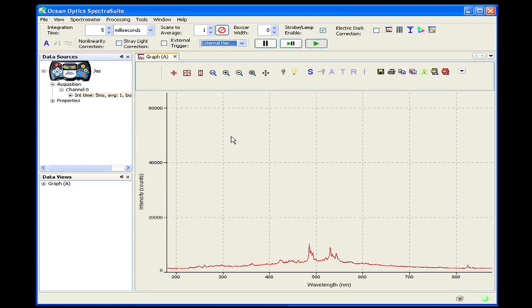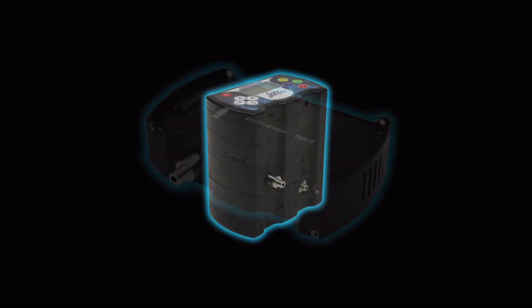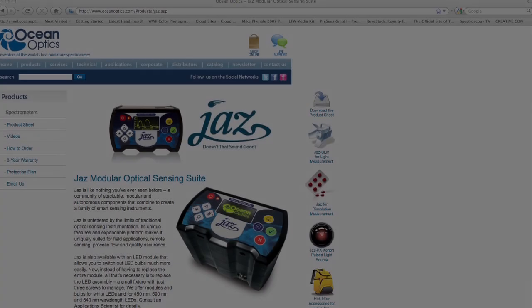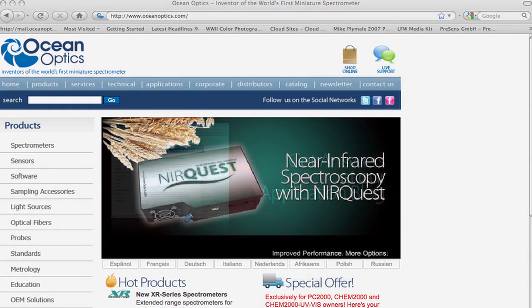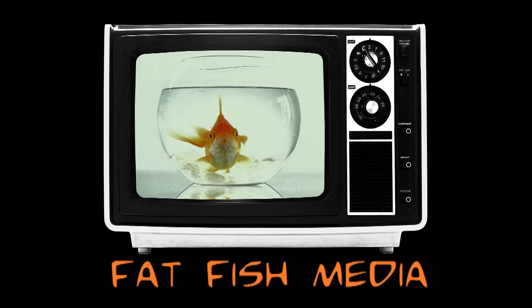We hope this video has helped you understand the basic setup and operation of the Jazz PX Pulsed Xenon Light Source Module. For more helpful videos like this one, be sure to visit SpectroscopyTV.com or look for the OceanOptics channel on your favorite video website. For more information on Jazz and other spectroscopy products from Ocean Optics, be sure to visit us online at OceanOptics.com.